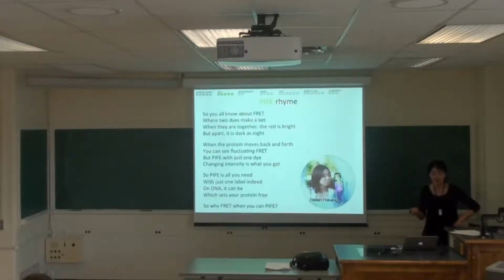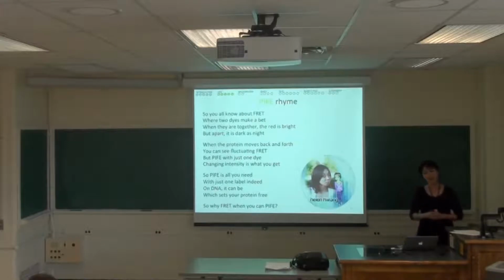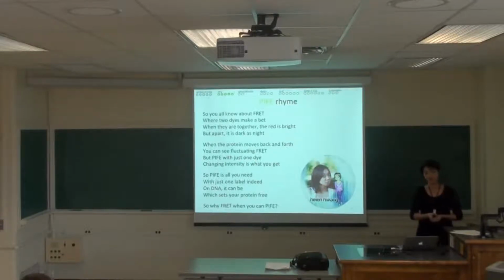In fact, in my lab, almost everyone uses both FRET and PIFE, because PIFE is an easy, quick test when you want to test protein binding. Let's say that you have a protein that's known to bind to some kind of DNA, and you have 10 different DNA substrates, and it's really difficult to label the protein. Then a quick check would be to prepare a slide with 10 different DNAs in different chambers, and just apply unlabeled protein to see if there's enhancement or not. So it's a really quick assay to run.